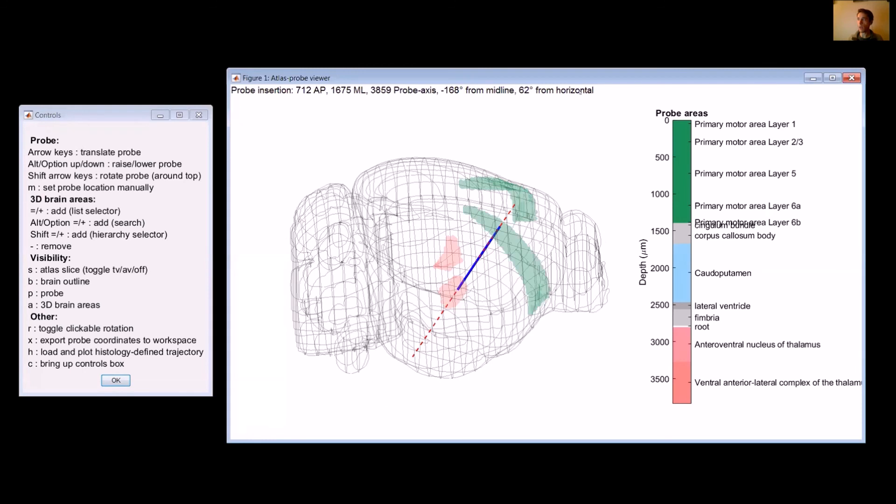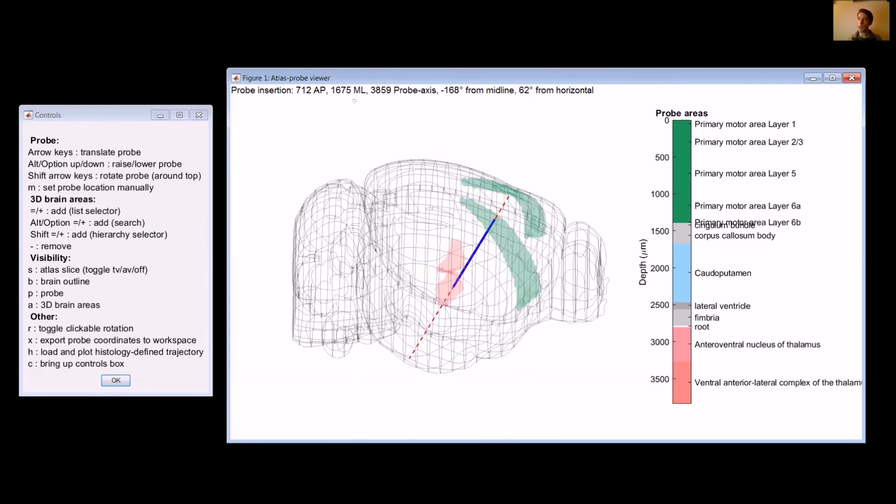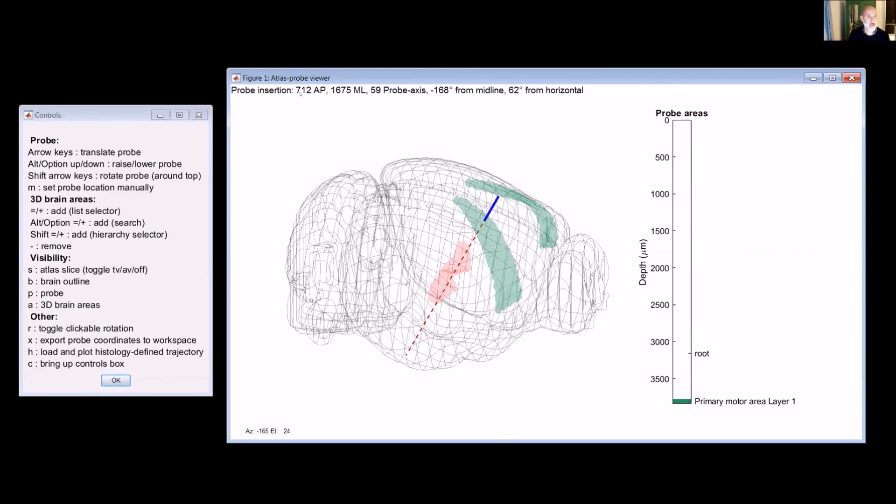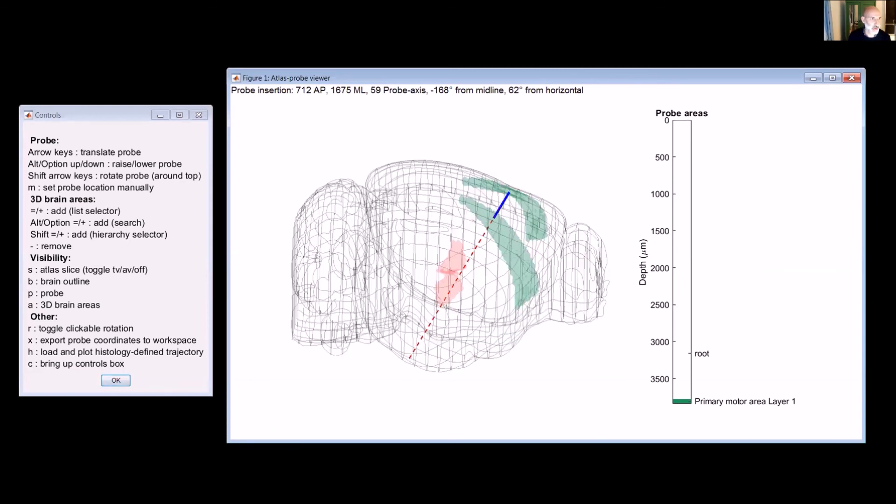These coordinates are based on approximate bregma as it relates to the Allen CCF. So Allen CCF doesn't give exactly a bregma coordinate. So we kind of guessed this by finding the AP position that looked the closest to bregma. In this case, 712 means it's 712 microns anterior, and then 1675 microns mediolateral. And then this final one is the probe axis depth. So this is once you touch the surface of the brain, this is how far down this goes. And so this number is essentially measuring from when the probe intersects the first part of the brain here. That might have been the question. That might have been actually the question. Is if you start calculating from when you touch the dura from when? Yeah. Yeah, that's right.